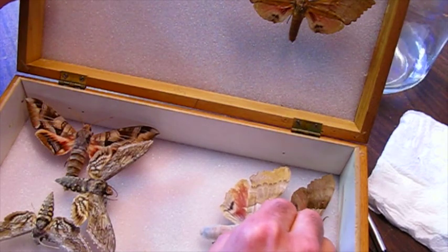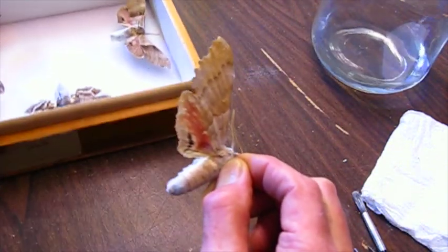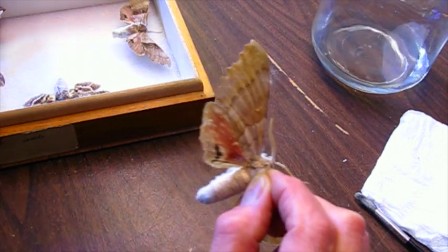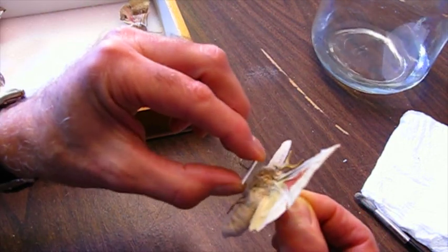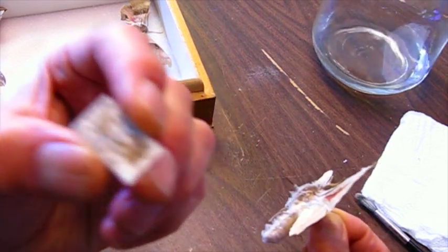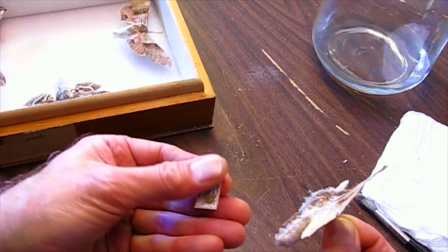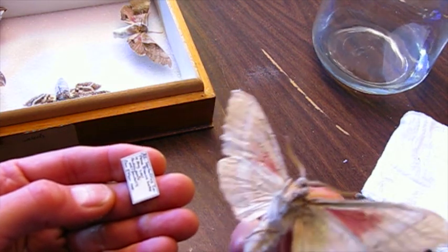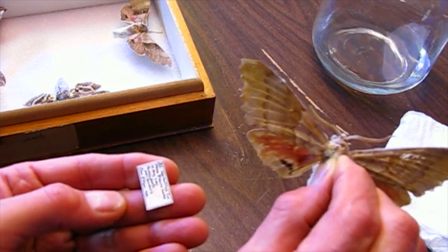We'll do another one, this is a big one. I'm going to pin the label to that so I don't lose track of it. This one is Pachysphinx occidentalis, from Arizona. This one's pretty moldy on the bottom as well as the top.